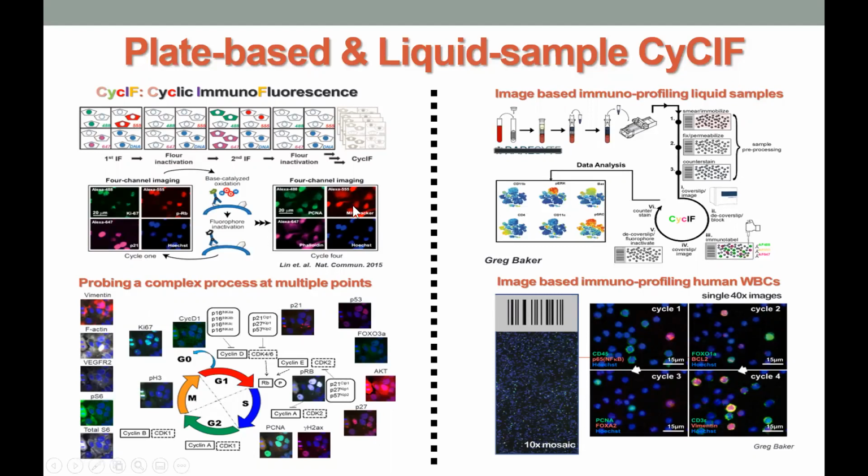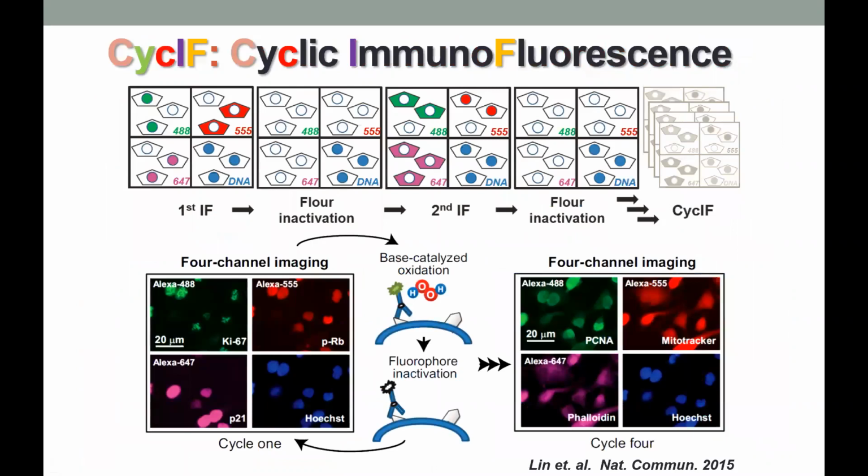We actually developed this cyclic immunofluorescence method earlier, before we did tissue imaging, using cell culture in a plate to do cyclic immunofluorescence. That was our first paper, published a few years ago. The good thing is that they use almost the same principle, repeated staining and removing of fluorescence, and now you can achieve high dimensional imaging, as you can see in the illustration right here.